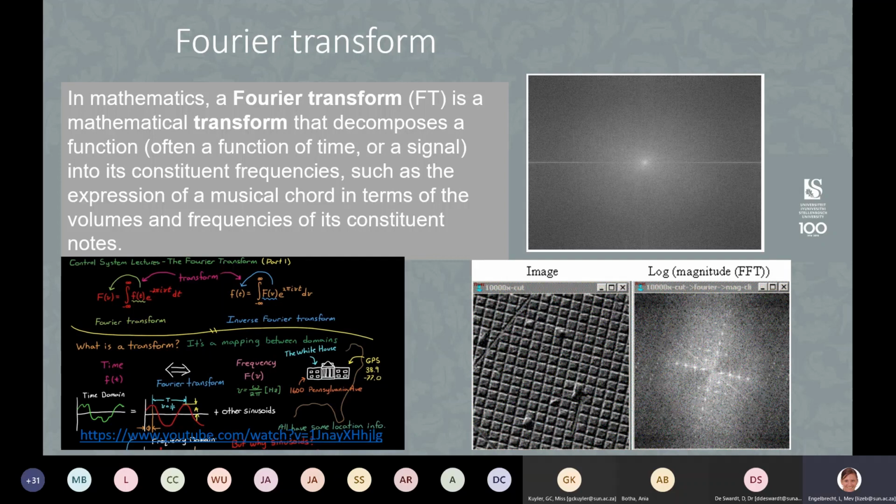But basically it represents the frequencies of your light, depending on where the frequencies are, high frequency parts of your image and low frequency parts of your image, in a whole different way, where your high frequencies are represented on the outside of the Fourier transform and your low frequencies in the middle. Low frequencies are usually the ones that are not very well focused and not resolved very well. So in the processing, eventually you would leave out the middle part where the low frequencies are. Also, the grid pattern forms a very nice pattern on the Fourier transform, and based on the fact that it's a known predictable pattern, we can also exclude where they are. But what is then left is much more resolved images than what you had before you processed the Fourier transform.